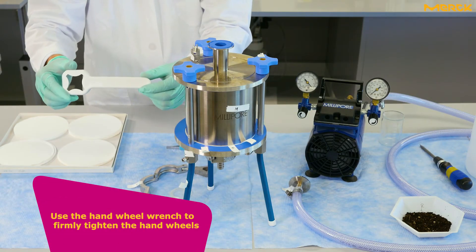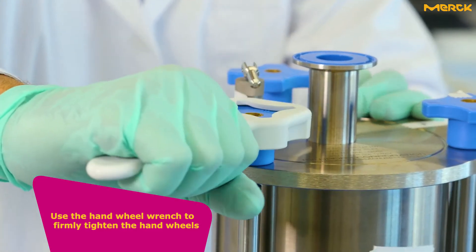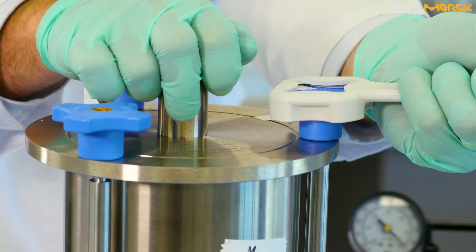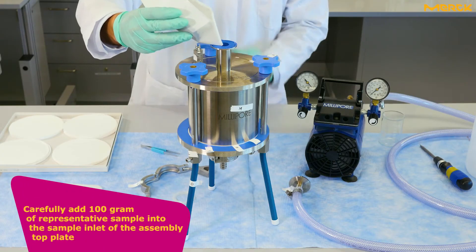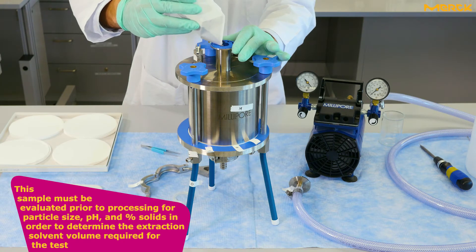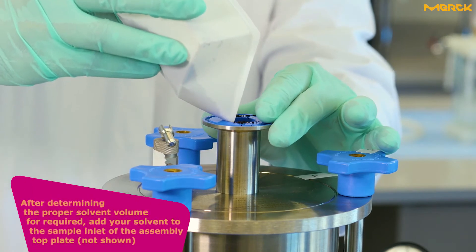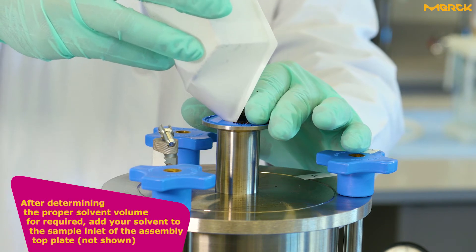Use the hand wheel wrench to firmly tighten the hand wheels. Carefully add 100 grams of representative sample into the sample inlet of the assembly top plate. This sample must be evaluated prior to processing for particle size, pH, and percent solids in order to determine the extraction solvent volume required for the test. After determining the proper solvent volume required, add your solvent to the sample inlet of the assembly top plate.